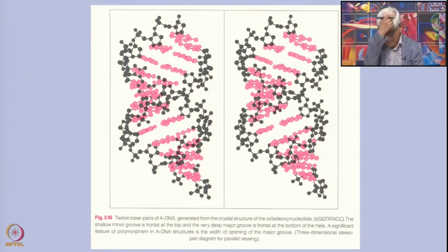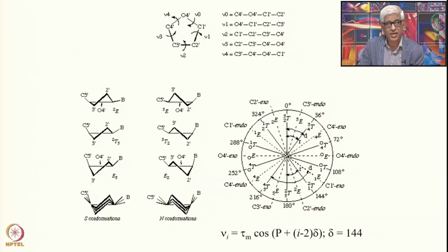Now, the fiber diffraction data could not give you any more detail about this. Now how do we get this information? You can use tools like NMR or crystallography, and people then actually synthesize small DNA segments to get more details into the structures of the individual nucleotide units or short segments of the DNA, because there is repetition in it.